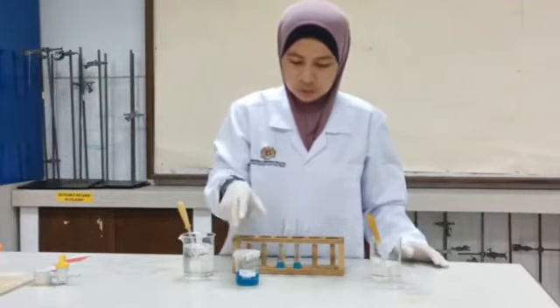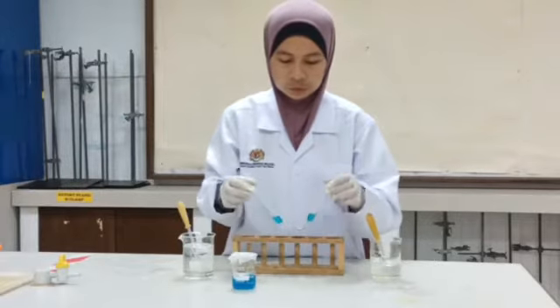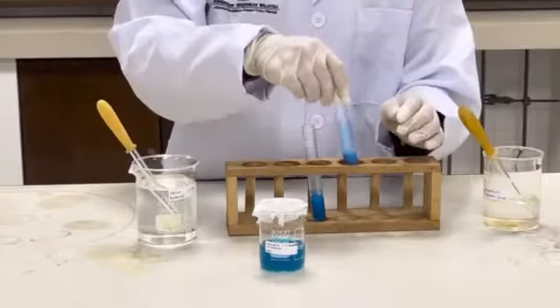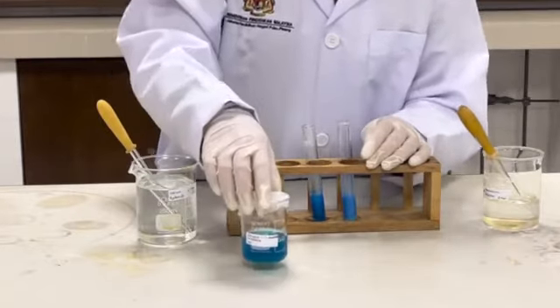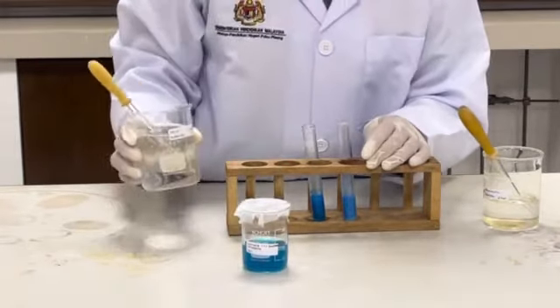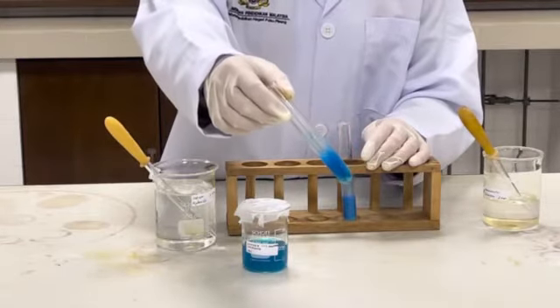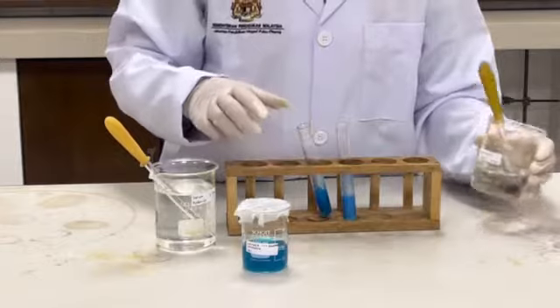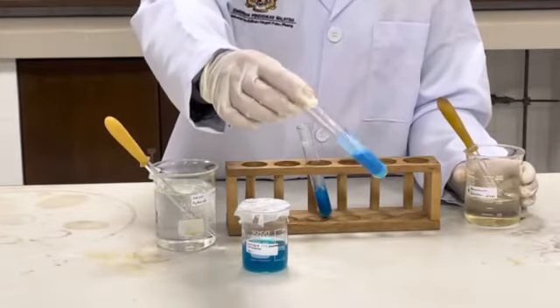Now we test the cation for copper(II) sulfate solution, the Cu²⁺ ion. Here we have 2 cm³ of copper(II) ion. For this experiment with the copper(II) cation, when you add sodium hydroxide in excess, you will get a blue insoluble precipitate. When you add ammonia solution in excess, you will get a dark blue solution formed.